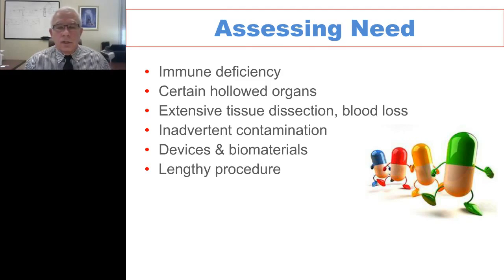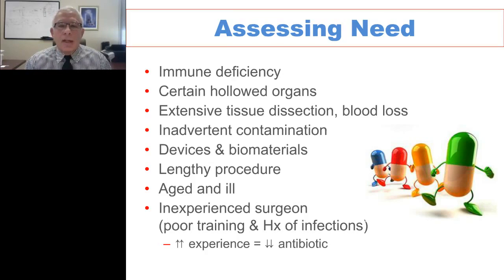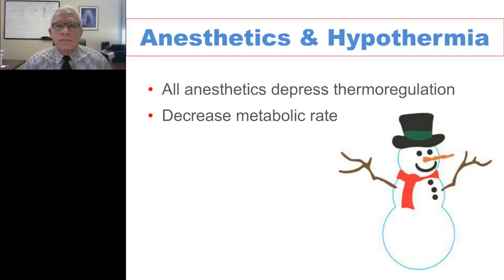If the procedure is predicted to be lengthy, maybe you need some coverage with antibiotics, as with aged and ill animals. And don't forget the inexperienced surgeon, who is going to cause more trauma. But as experience and technique get more sophisticated, the need for antibiotics definitely decreases.